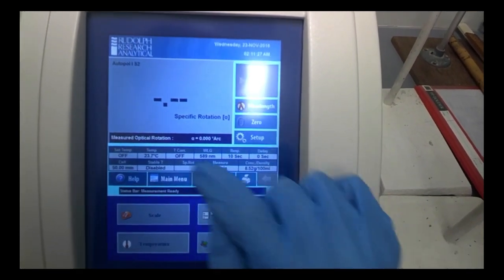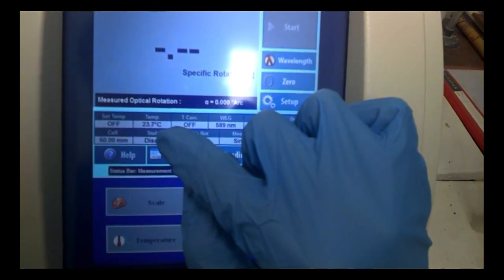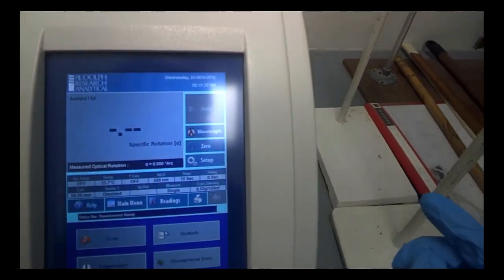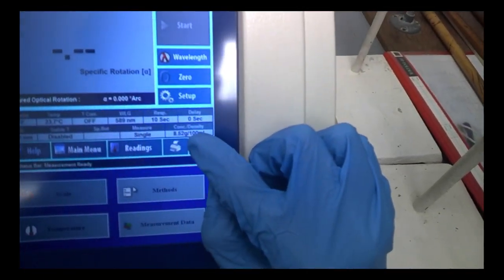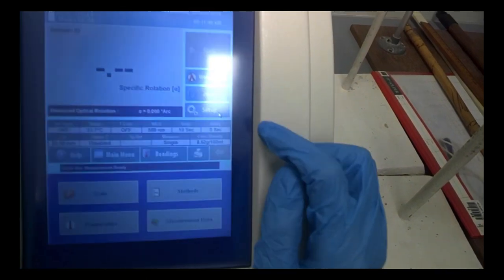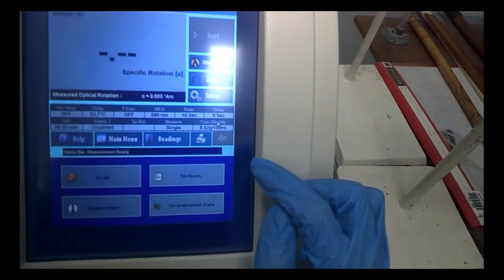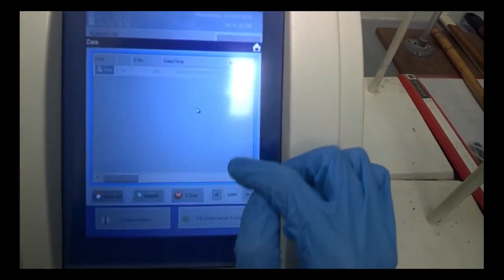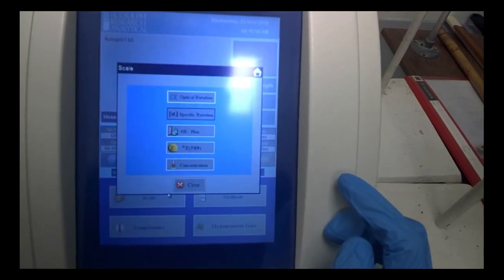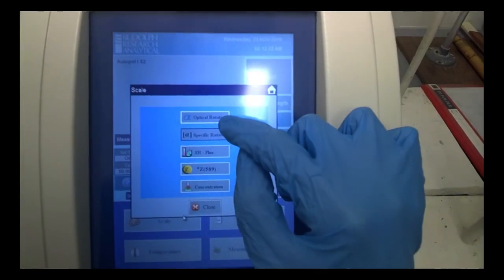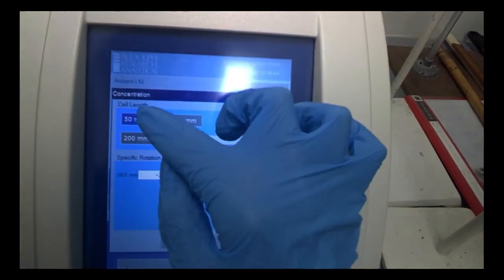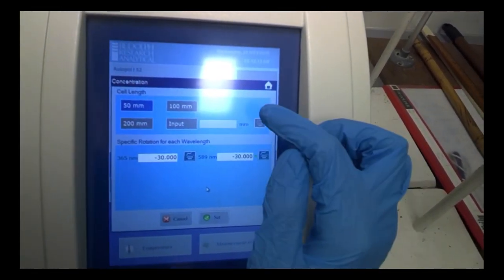We also have the internal temperature, what is the actual temperature inside, because we know that the optical rotation is temperature dependent. And in this case, you can also adjust the concentration of the solution that you have inside. You can set this measurement data. We can key in the optical rotation, specific rotation, and the concentration of the sample. So here we do not adjust anything, but you can key in the cell length, let's say 5 cm, 10 cm, etc.